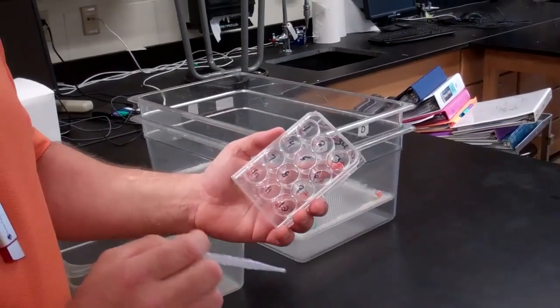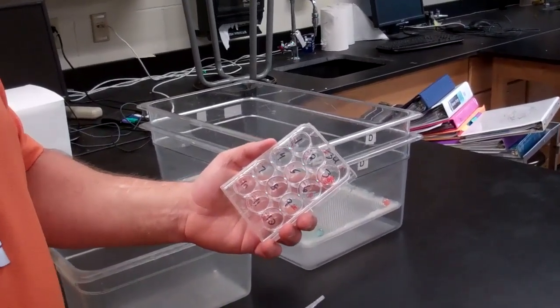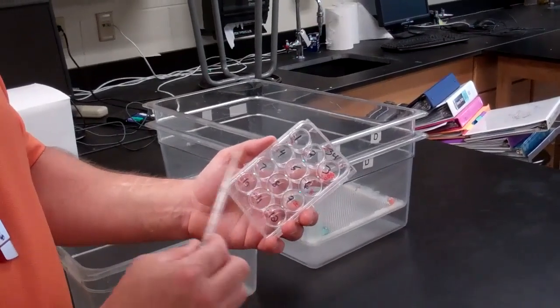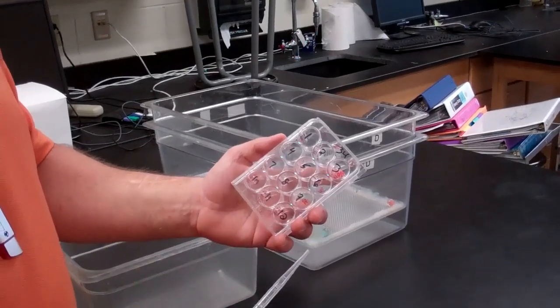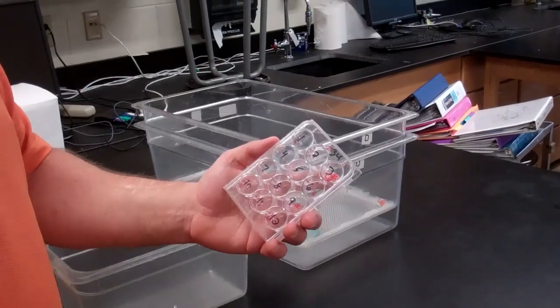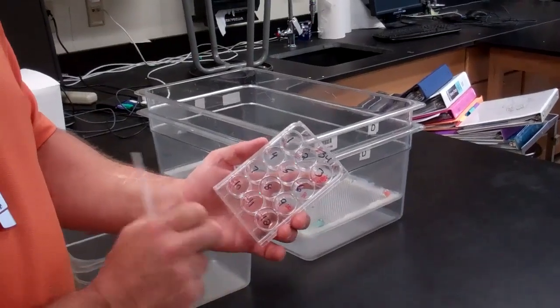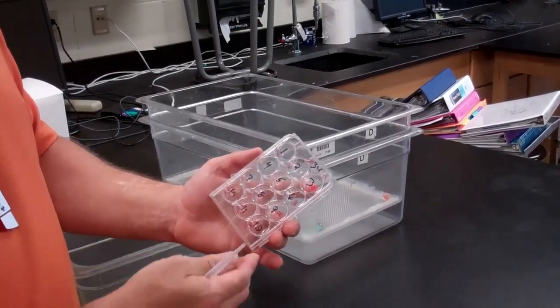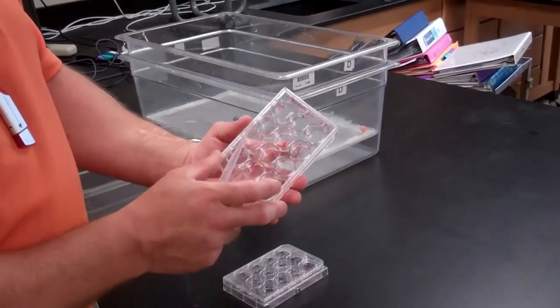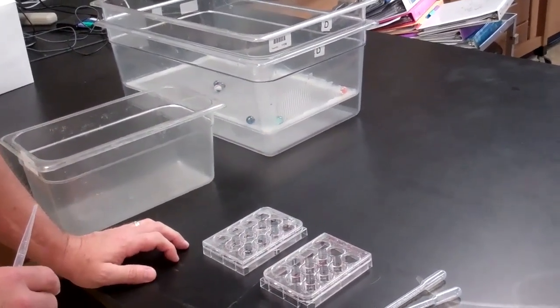We did the temperature test first, and I used that as a way to reduce the fumble factor a little bit. The students set up the falcon dishes and the wells, and after we got experience with the temperature test, they went on and did the other chemical tests like ethanol and nicotine and so forth. The temperature test was a nice way to get them experience with their lab technique and working with the eggs. The students would label the dishes, and that eliminated a little bit of the error in getting the right number of eggs into the right dishes.